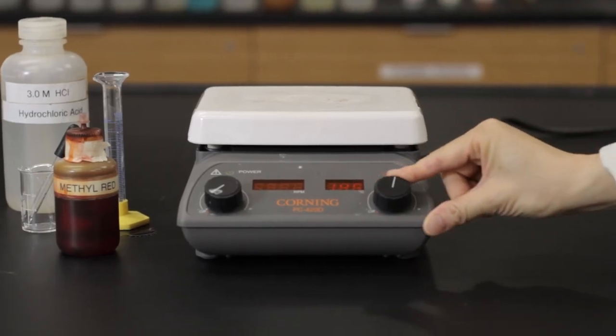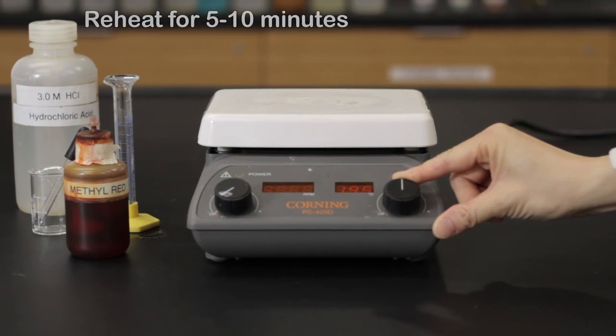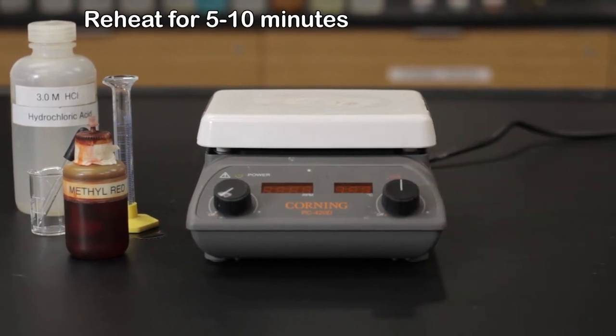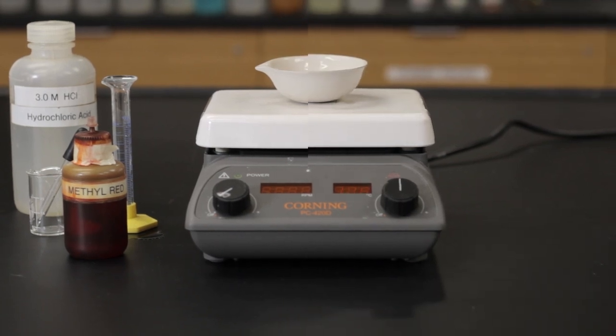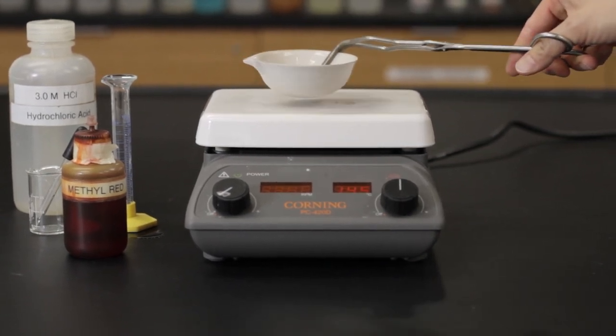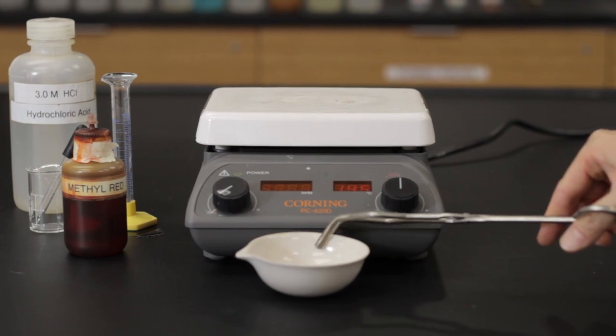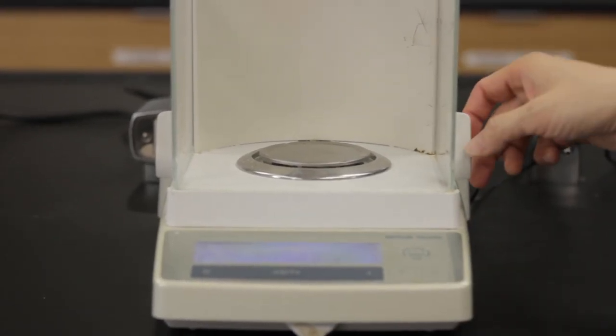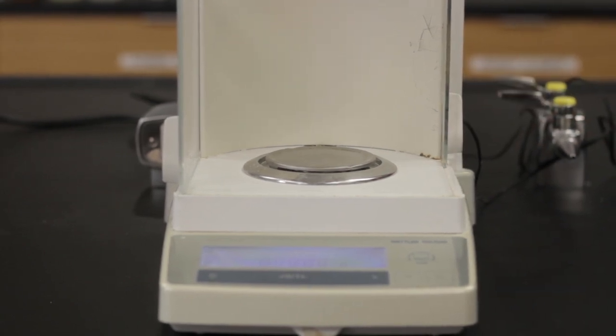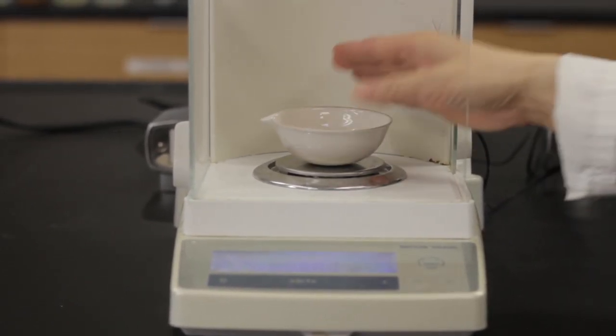Reheat the evaporating dish directly on the hot plate. Remove it off the hot plate using crucible tongs and allow it to cool to room temperature. Weigh the evaporating dish and record the mass. Continue reheating and reweighing until a constant mass is obtained. Then you'll know the product is completely dried.